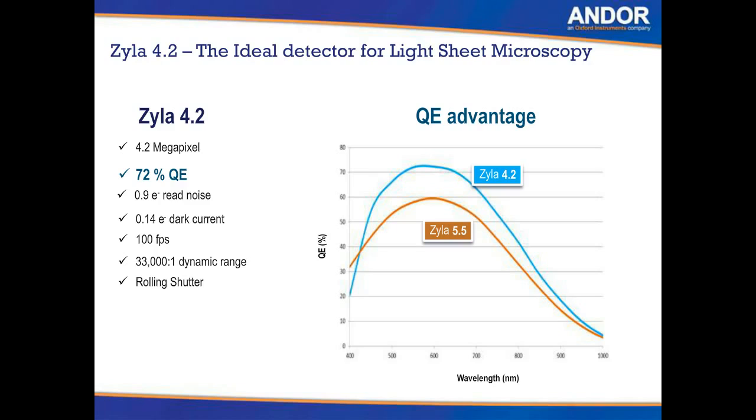microscopy application. Now, with the other sCMOS chips where you have a 5-transistor, you have an additional exposure mechanism which is called global shutter. The global shutter essentially will give you all pixels being exposed at the same time. So it's a global exposure. All pixels on the chip are exposed at the same time and all are read out at the same time.